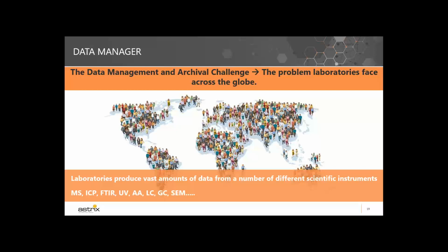Going to a new topic here, we're talking about the SDMS for SampleManager. SDMS stands for Scientific Data Management System. On SampleManager, that is called the Data Manager module. Some of you may not understand really what this module is for, but this module is really trying to resolve an issue, and that mostly applies to pharma companies, the way I see that, for the data management and the archival of that data over time.